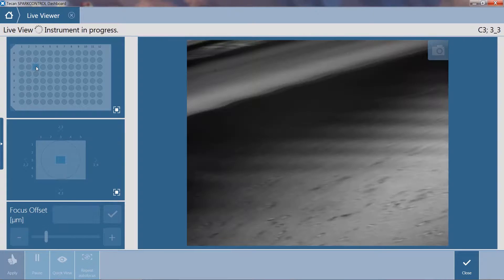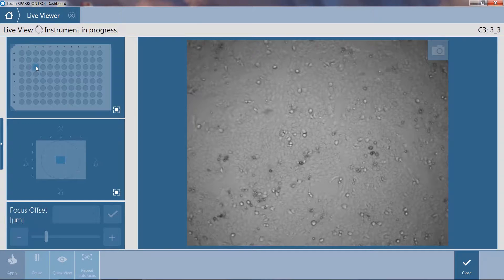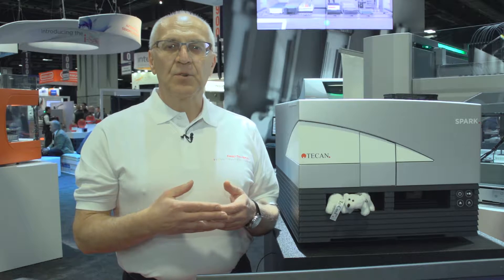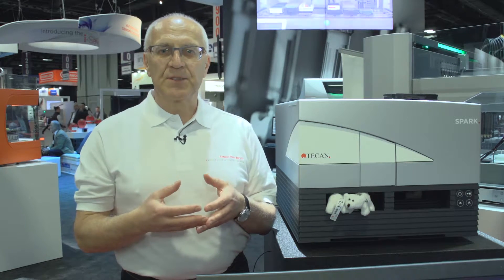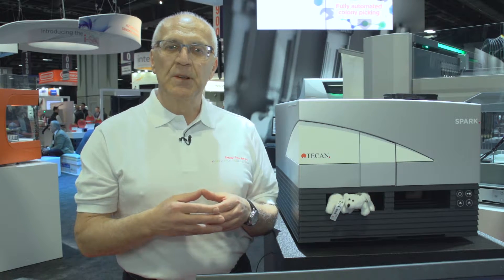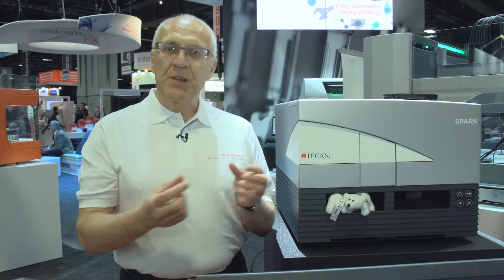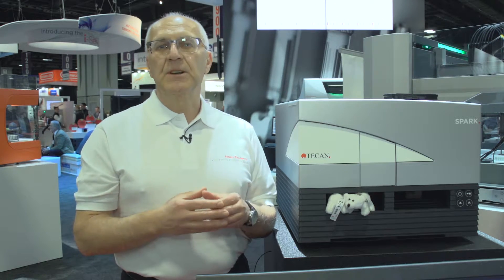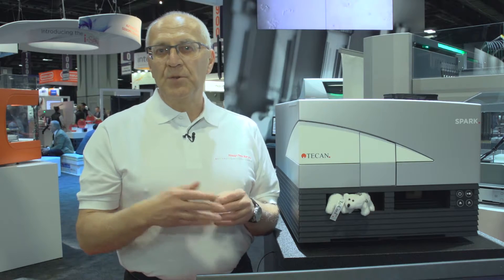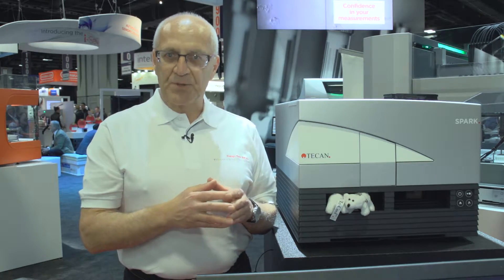First of all, let's assume you're running cell-based assays. The first step is cell counting of suspension cells. When you're trypsinizing cells from a T-flask you want to study the concentration of your cells. You can do this in the Spark with the imaging module based on bright field optics and the cell chip to count the cells. You get the concentration within 20 seconds, and moreover if you use trypan blue staining you get a live/dead ratio as well.